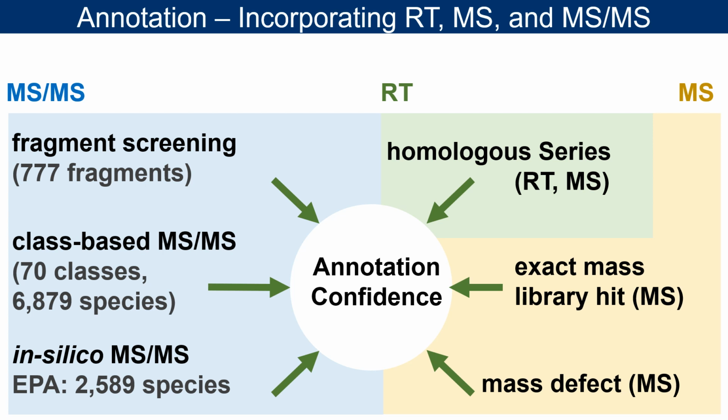Two other aspects that we use for MSMS are class-based and in-silico-based MSMS. For many users, especially high-throughput laboratories, there won't be enough time to investigate all the evidence that FluoroMatch gives to discover unknowns. In this case, your lab may just want a list of high-confident annotations, or maybe you want both. Class-based MSMS gives high-confidence annotations by taking standards.